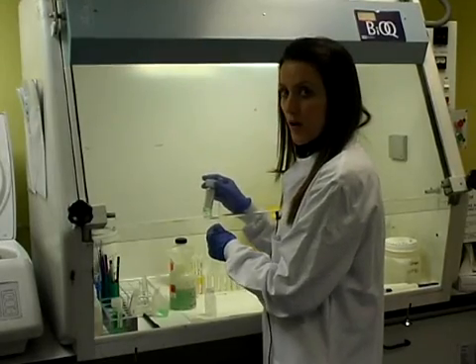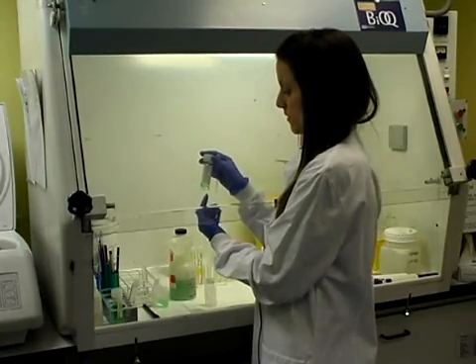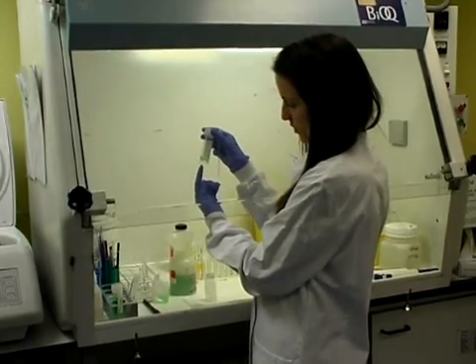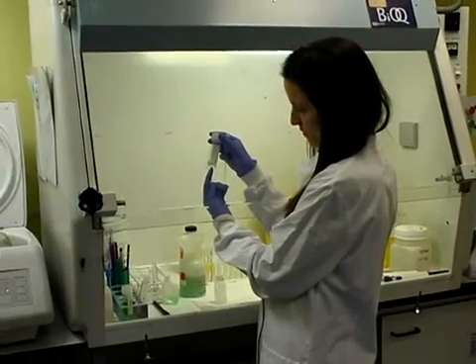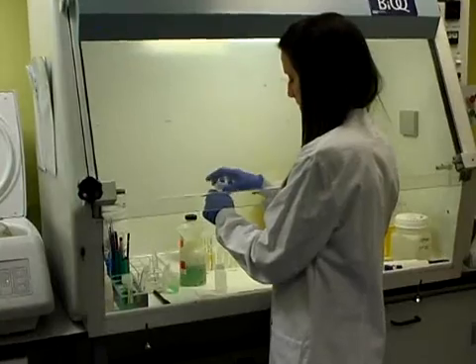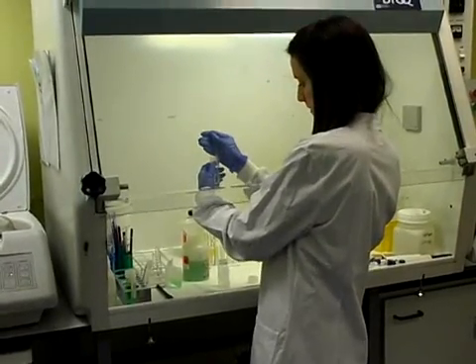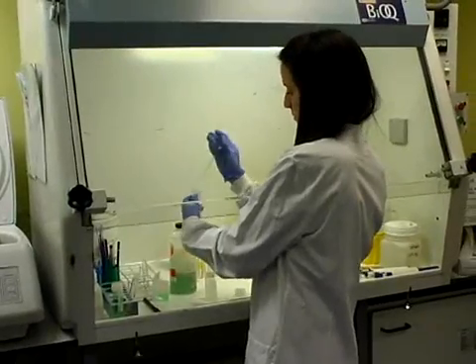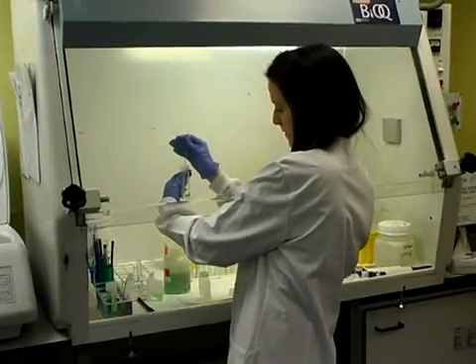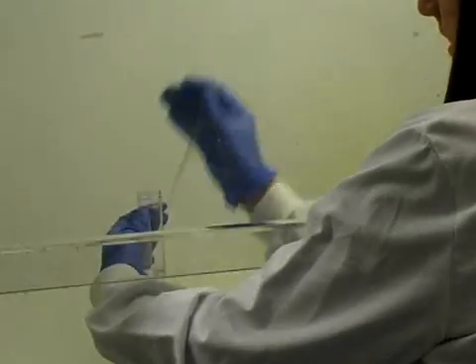This is a urine sample which we first spun down to collect all the cells at the bottom in the pellet. As you can see, it's a conical shaped cone at the bottom where you get a collection of the cells. We then pipette off the supernatant, which is a preservative, to the bottom of the cone where there's still the collection of cells.